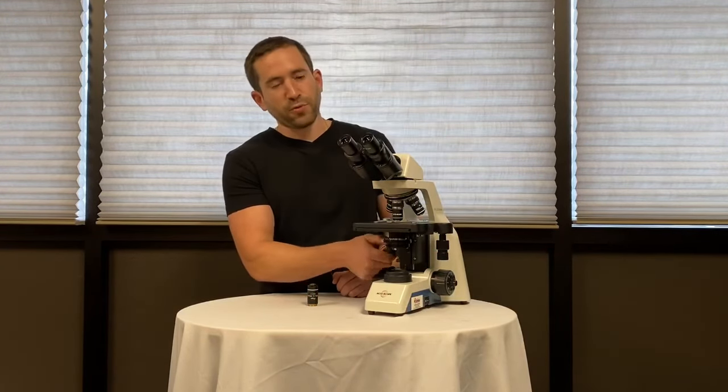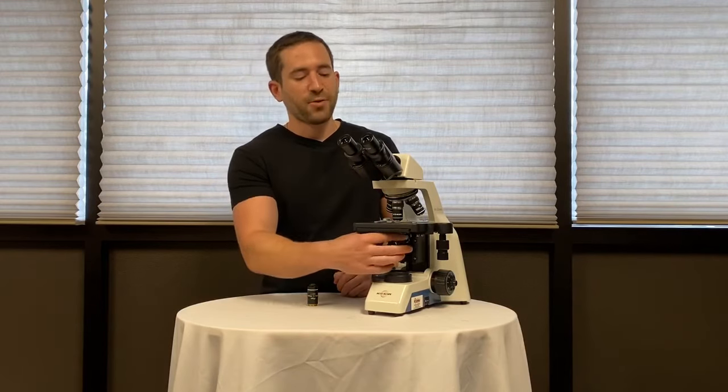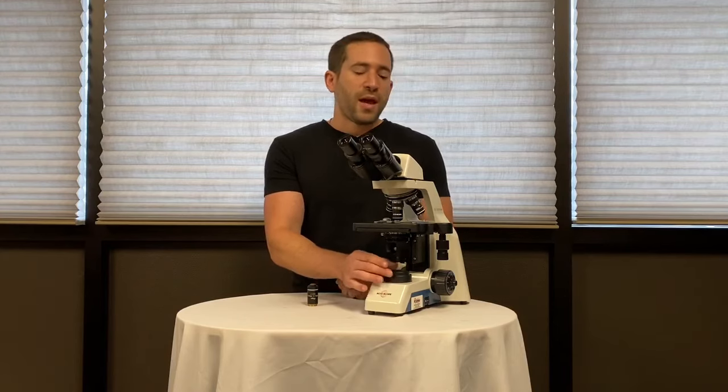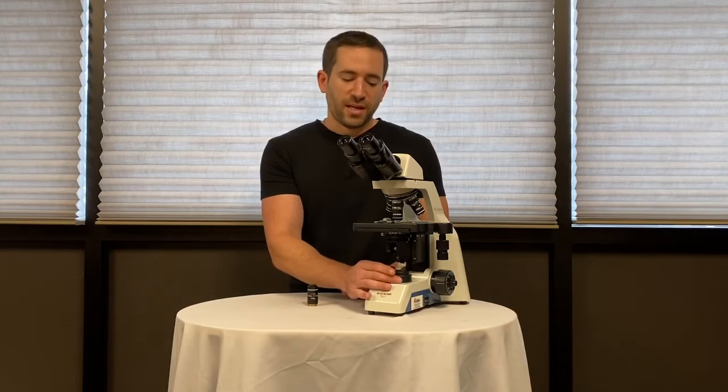The condenser is fully focusable and has an iris diaphragm for adjustment. The LED illumination is variable and eliminates the need to change any bulbs.